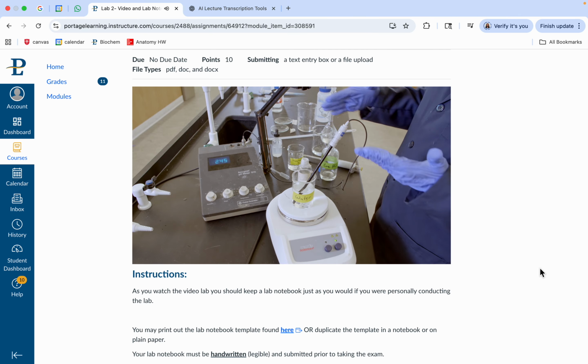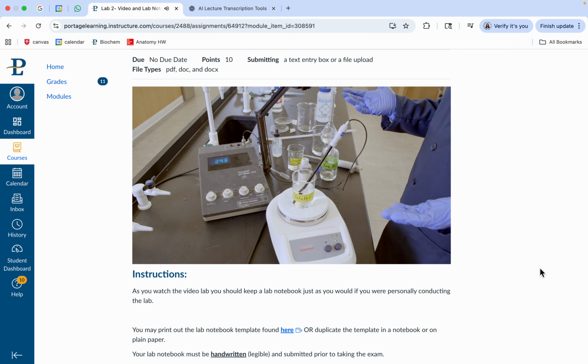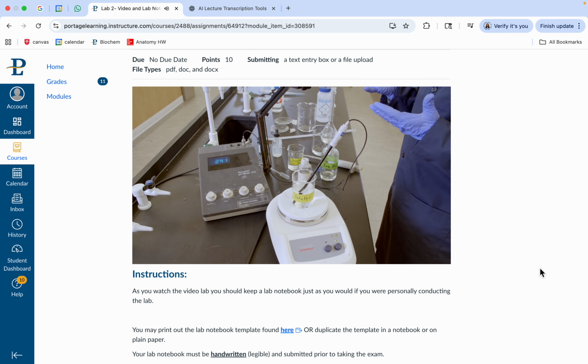Notice that there's a significant difference, right? We went from about 7.8 with the same volume of HCl down to 2.45. So there's a drastic change in the pH. That would not be good for a biological system. If the pH changed that much, it can change the structure and other things about the molecules. That's why buffers are so important. We saw our phosphate buffer maintain the pH, dropping just a couple of points, but the pH in water went down to about 2.4, a really big drop. So this shows the importance of buffers in a biological system.